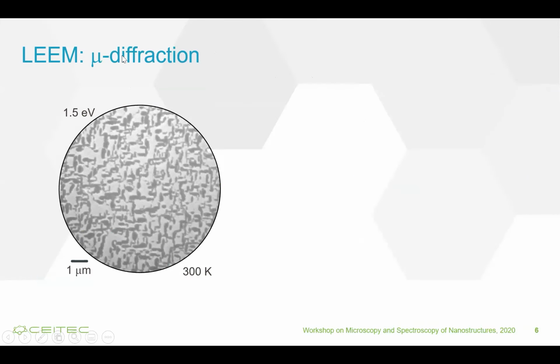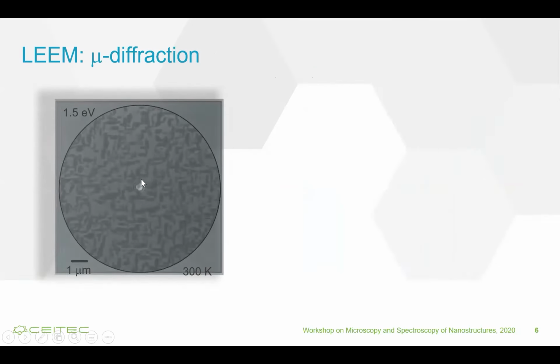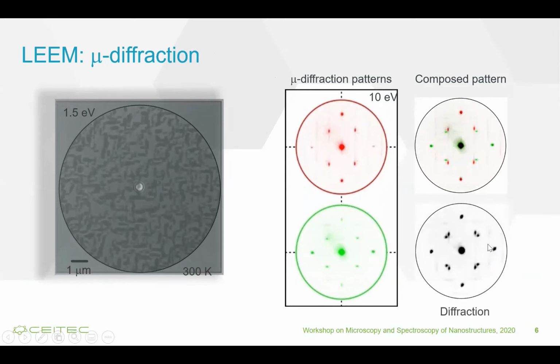I will go into detail in the presentation. Then the specialty is the micro diffraction. We take an aperture with a diameter down to 200 nanometers. We select the area which we illuminate with the electron beam, and then measure diffraction really from one of these small areas. If we measure different areas, we see two distinct diffractions for the single molecule phase, which are the rotation domains.